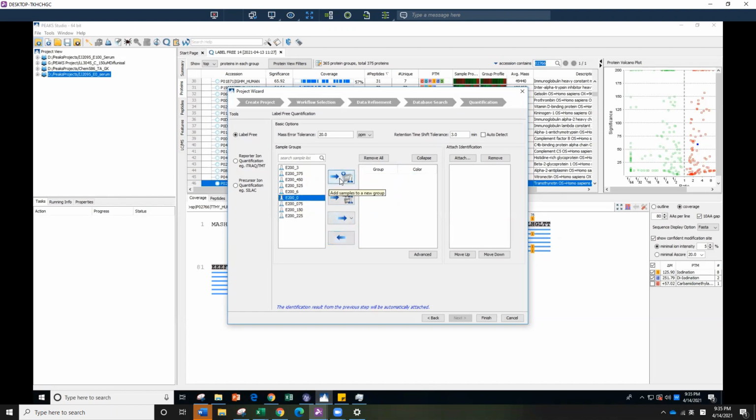So again, just push them using the double folder 1 according to the order. So 0, 0.75, 1.5, 2.25, and 3, 3.75, 4.5, 5.25, and 6. And then again, just name it again.